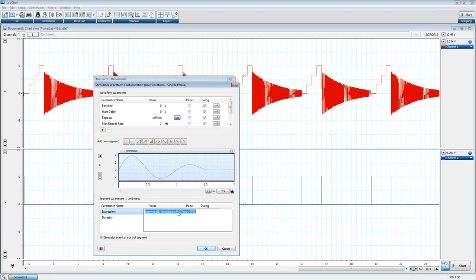that's what it does. If I change the phase, you'll see we'll start moving where we start with the sine wave. So different ways that we can go in and change things. We're also seeing my exponential decay kind of affecting things here. And we'll kind of talk about that in a little bit. So I'm going to go back to how I had it.